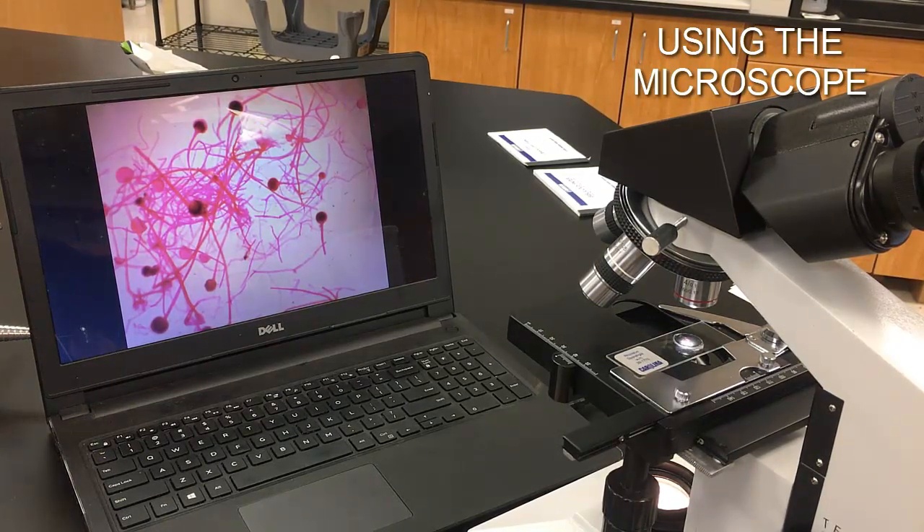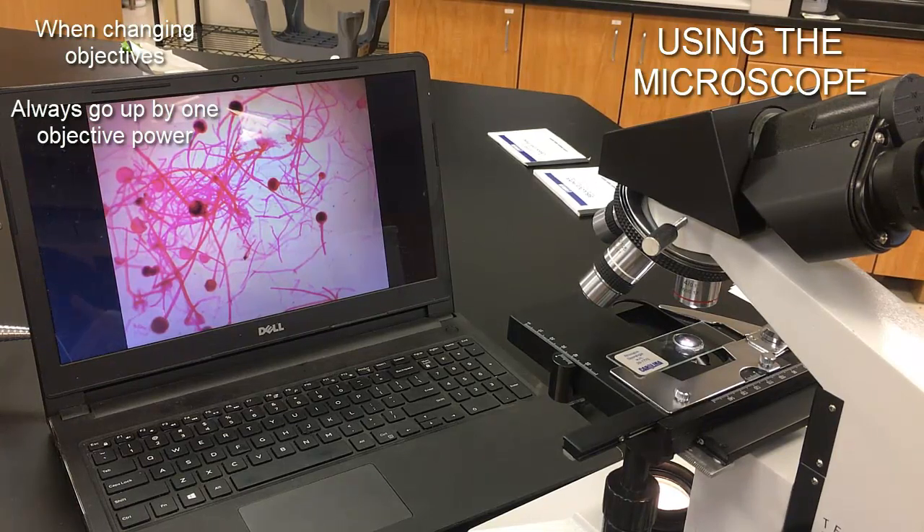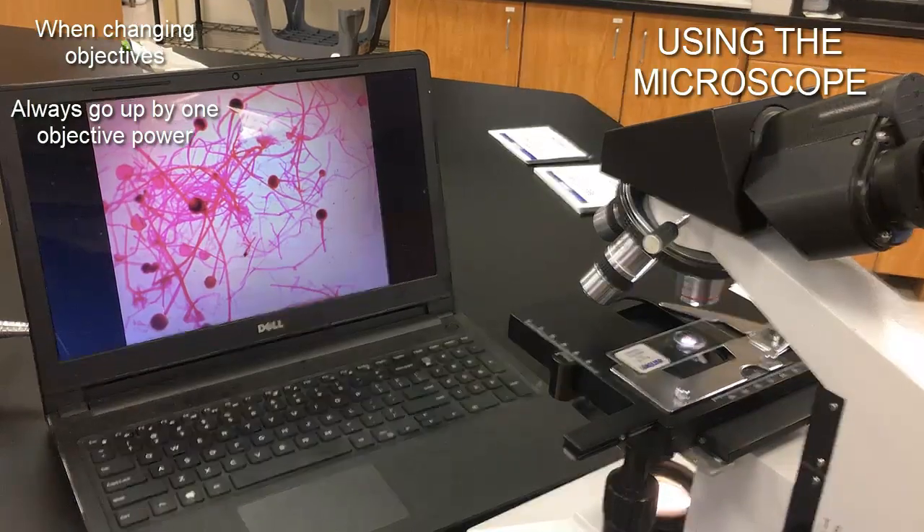The 4x objective gives 40x total magnification. For something like what we're looking at here — mold spores — which are relatively large, we can actually see them well at 40x total magnification. You may not need much more than that. But if more magnification is needed, go to the next objective in sequence — in this case the 10x objective. We don't skip objectives; we don't go from 4x to 40x or straight to 100x. We go in sequence. Make sure the image is centered in the middle before switching.